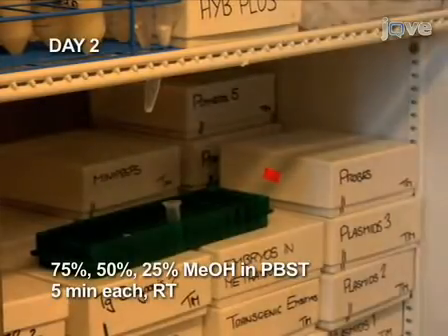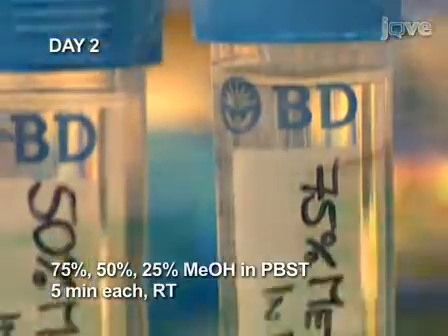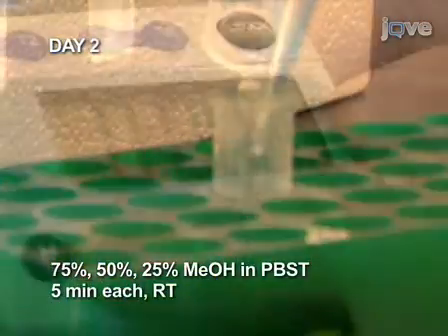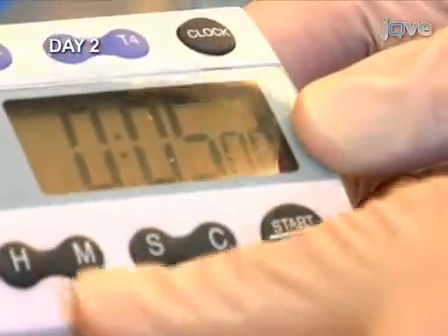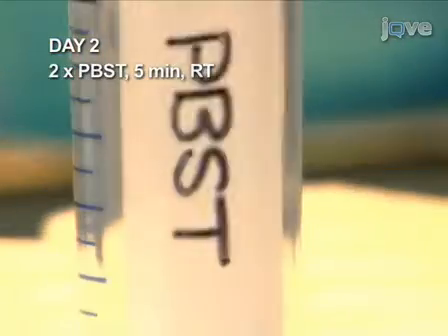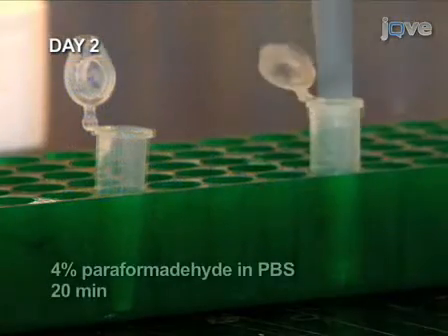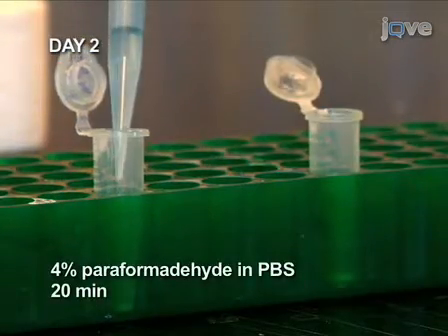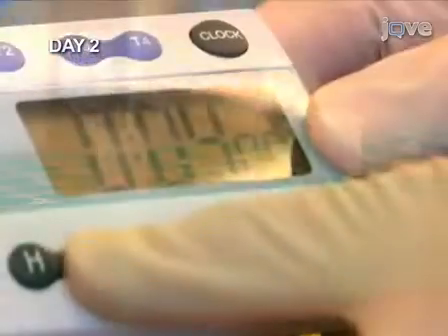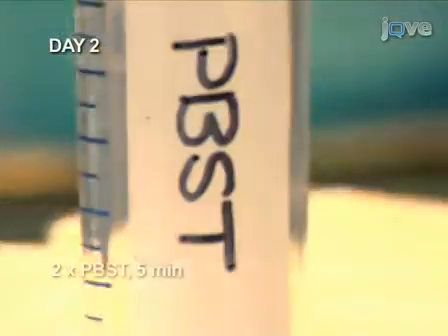The next day, transfer the embryos through a series of washes of decreasing methanol concentration, ending with two 5-minute PBST buffer washes. Next, fix the embryos in paraformaldehyde for 20 minutes, then end the short fixation with two 5-minute PBST washes.